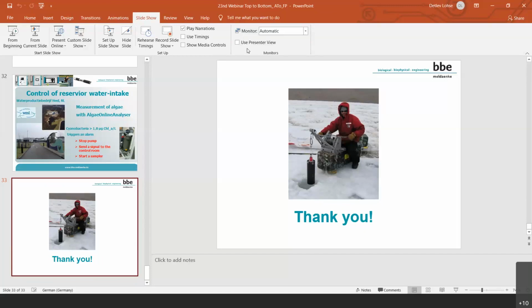When you want to measure very sensitively, you have to perform a blank measurement before you do this analysis. But I think under the conditions where we measure, the sensitivity is high enough to work under most circumstances without any blank or offset measurements.